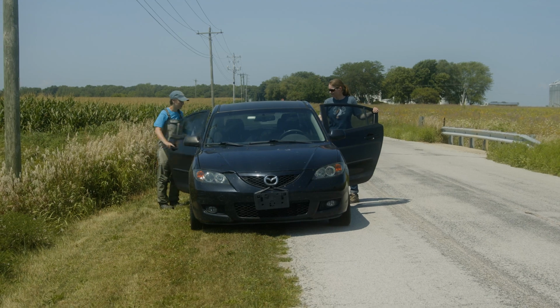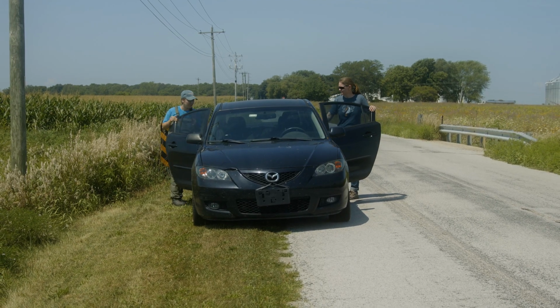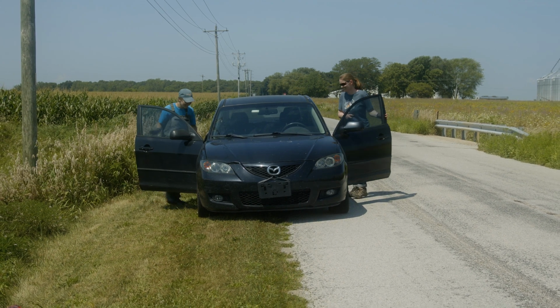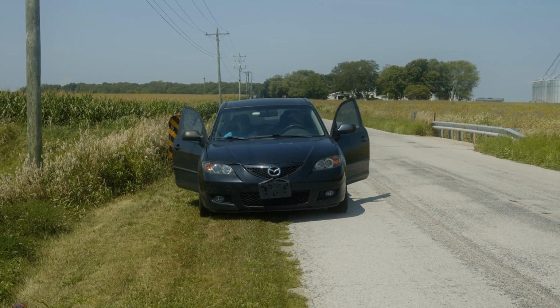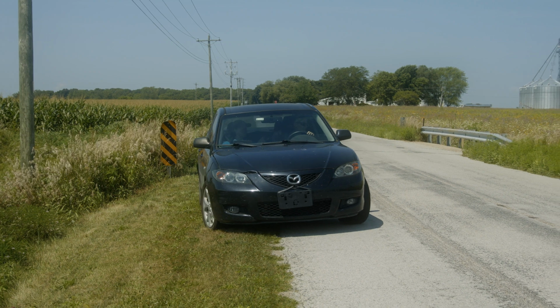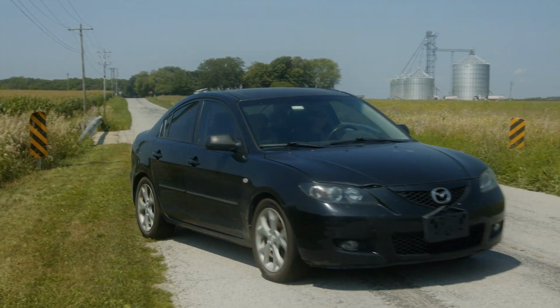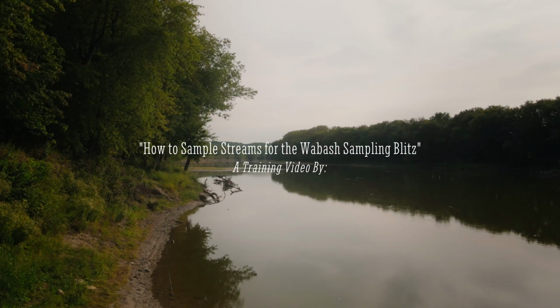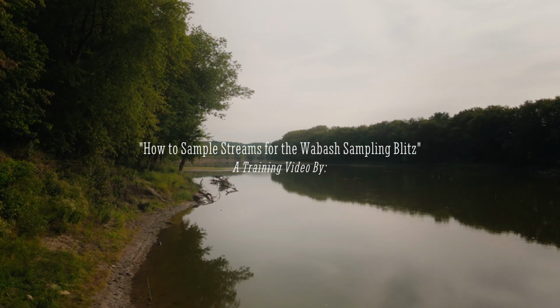Navigate to your next site using the information on your clipboard and repeat this process for all your sampling sites. Each group will have 3 to 5 sampling sites. Once you have sampled all your sites, return to your staging location to drop off your supplies. If you forget any of these steps, consult your clipboard for sampling directions.